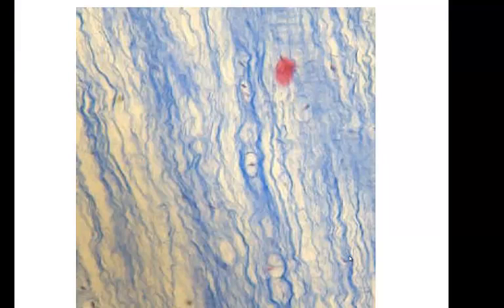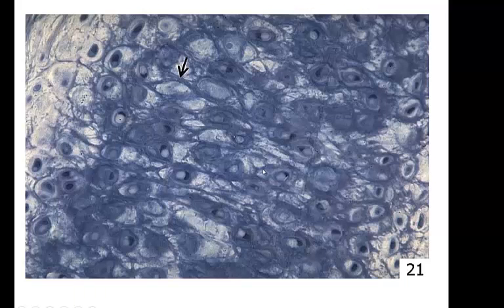Now here's some more fibrocartilage. You barely see any chondrocytes on this one, but this is fibrocartilage. You have a lot of collagen fibers in a row.